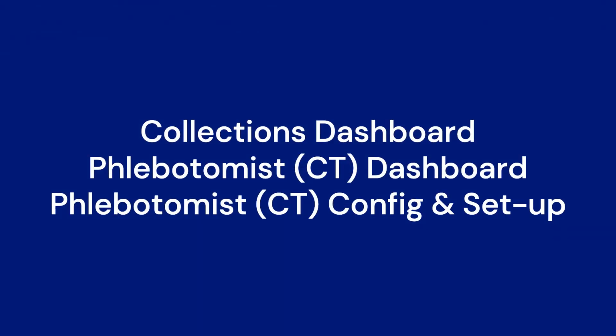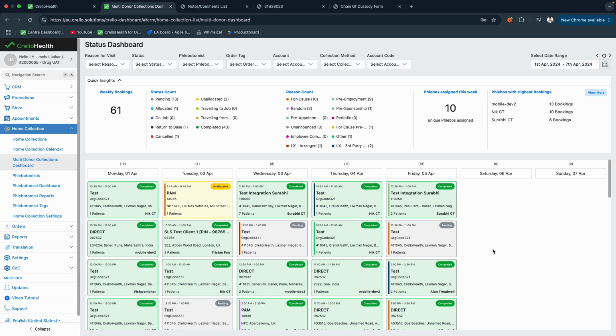So in this video, let's see what are the different kinds of dashboards that we have, what insights can we draw, and how do we set up the phlebotomists. So this is a multi-donor collections dashboard. All the collections that happen in a particular week will pop up here.